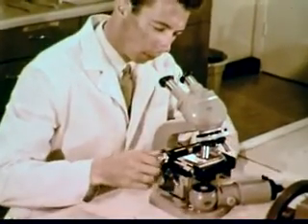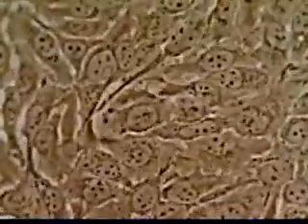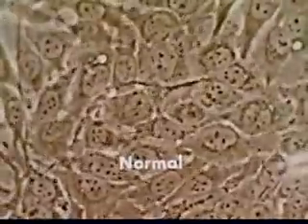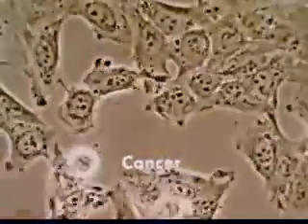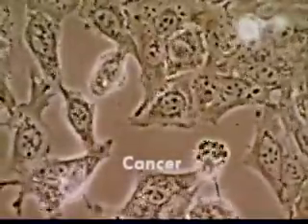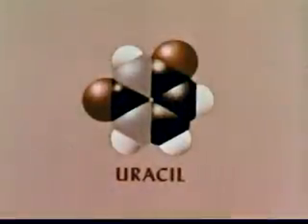By means of tissue culture technique, human cells are kept alive for microscopic observation. Here are normal human skin cells under the microscope. In time-lapse photography, cellular activity appears accelerated. We know of very few differences between the chemistry of normal cells and these cancer cells. One remarkable difference, however, is that the cancer cells grow faster. And another difference is that during the faster growth, the cancer cells use abnormally large amounts of a substance known as uracil.